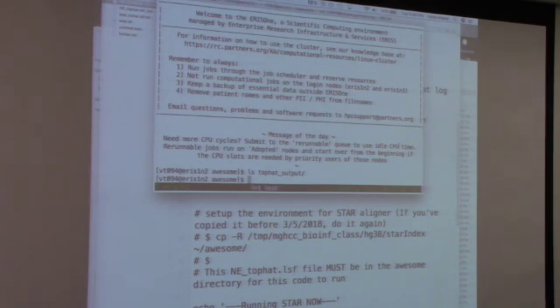Okay, it's doing things. So apparently there's a bug. You don't need to do this. You just need to make the directory. Yeah, that's right. Okay, and then you have to do those three modules. This one, but this one I actually did. Yeah, I think you do that one. Still running. You'll get an error, so let's figure out that error.